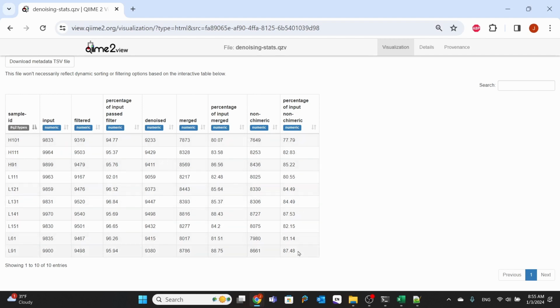So this is actually pretty good. Most of them are over 80%. So we have good retention overall.